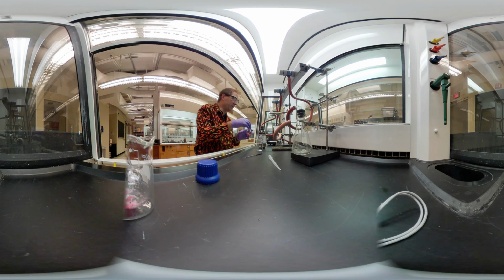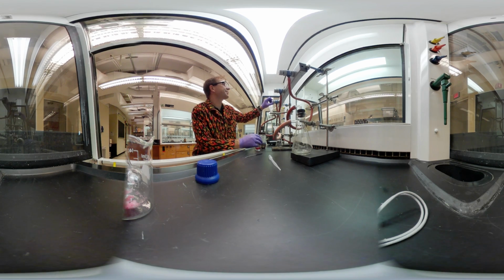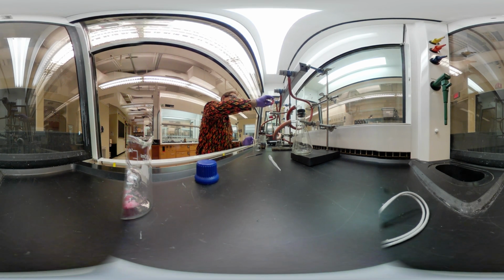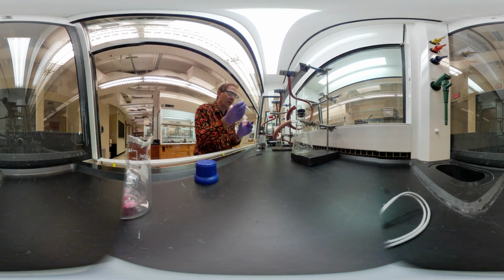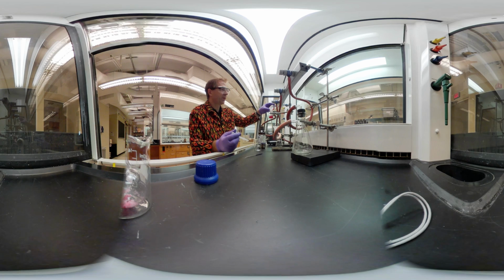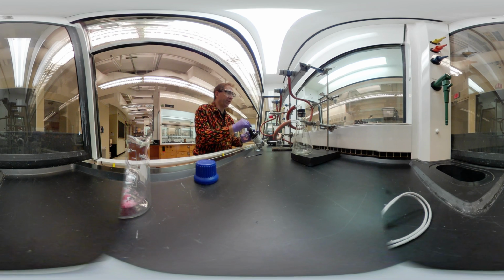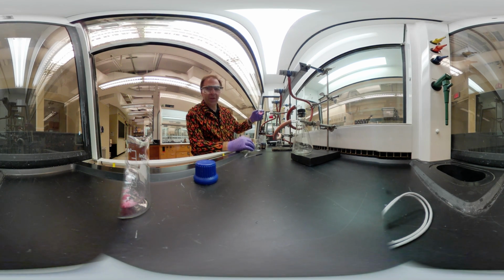Okay. Oh, wrong one. Also, make sure you use the hose that's actually connected to your flask. There we go. Alright, swirl this thing around. Okay. Again. Shoot this in. What you're seeing here is the air being pulled through. Hopefully I won't lose any of my product. This is more vigorous than the other one. Just a little too excited to do chemistry there.